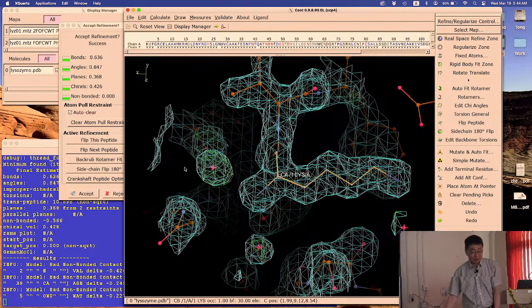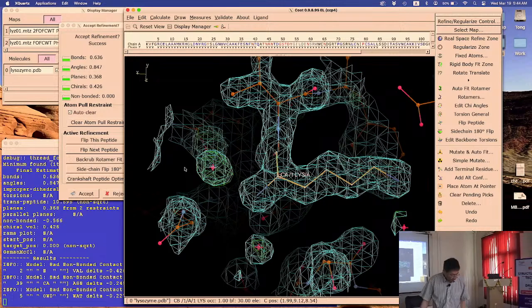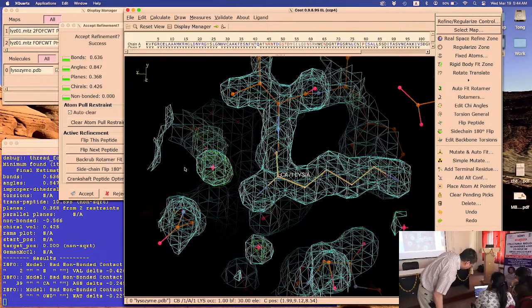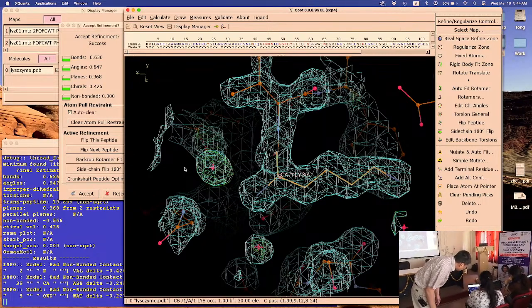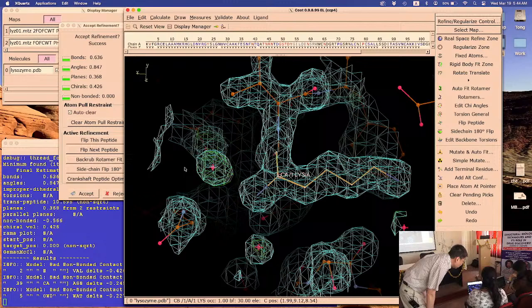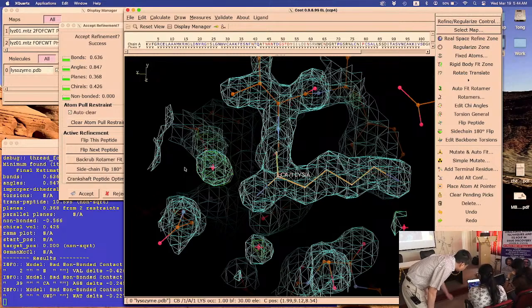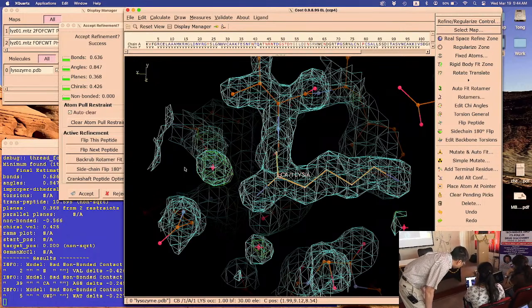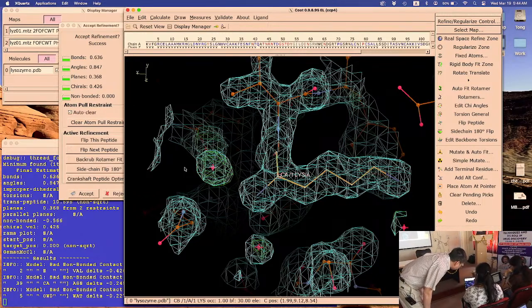Okay, let me look around again, see how many succeeded. Turn a little bit. You're looking at the arginine. Oh, you built the arginine in? So I've used this mutate. I've added the arginine by simple mutate, like here I'm adding. Which residue is this? Arginine. No, which residue number? It's the valine. Right? Residue 2, right? Should be a valine.